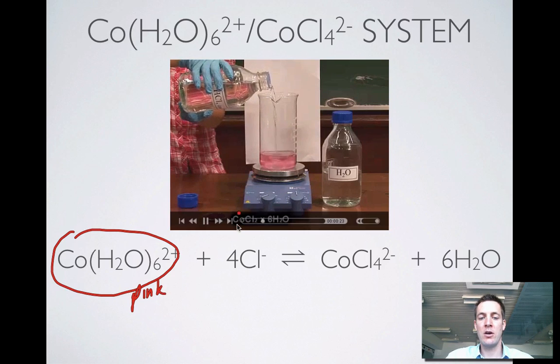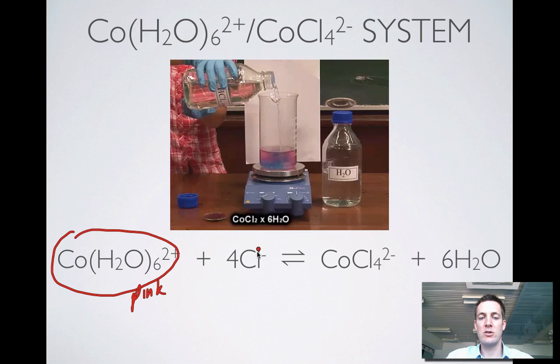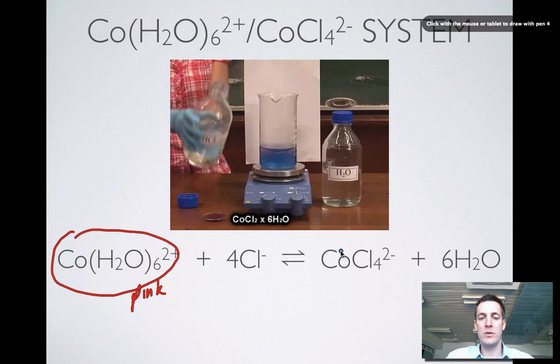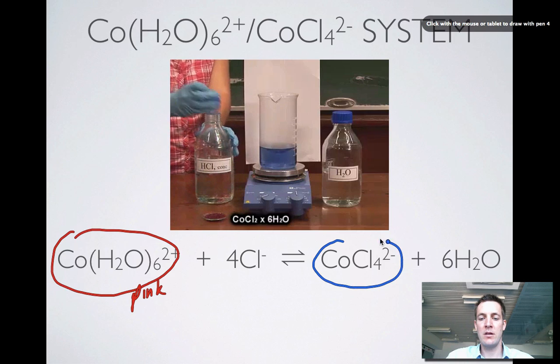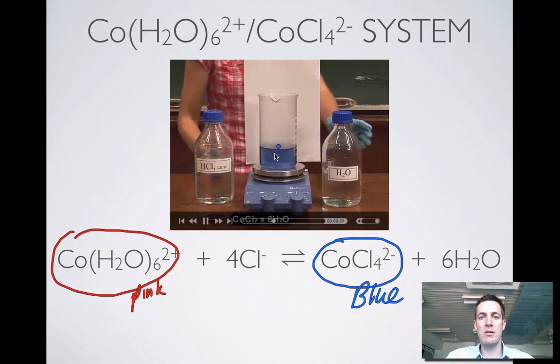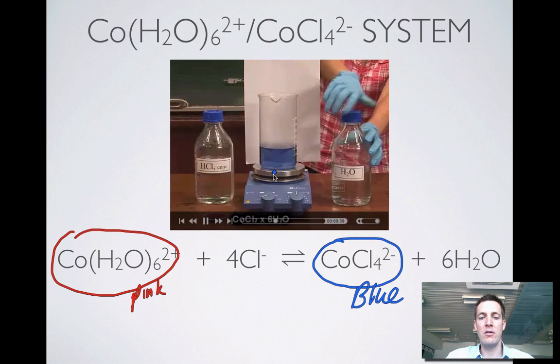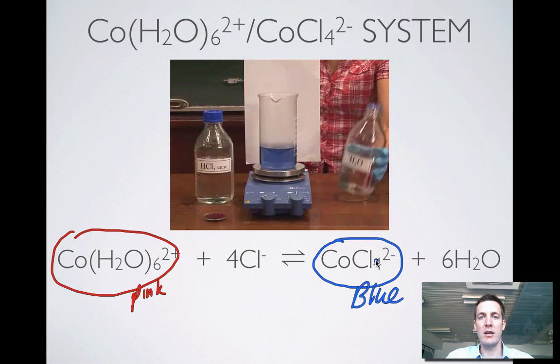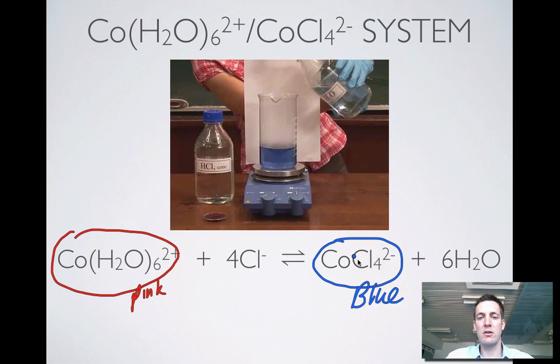And we're adding chloride ions. This bottle's got hydrochloric acid in it. So we're adding chloride ions. What happens when we do this? Well, this ion happens to be blue. So we can see the beaker's clearly gone blue. So when I added chloride ions, the system shifted over to the right. I added a reactant. It shifted over to the right.